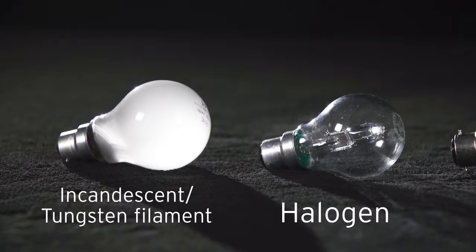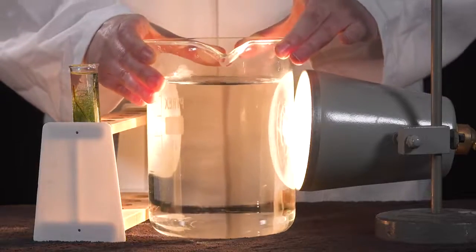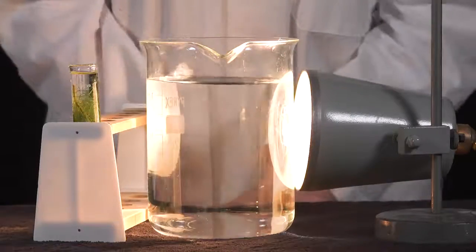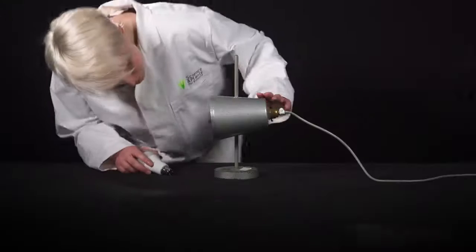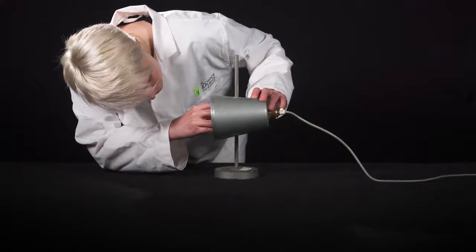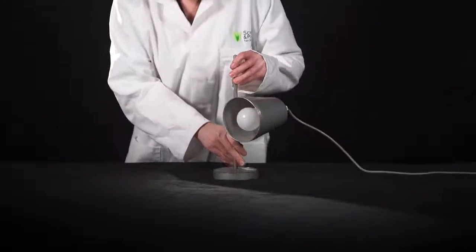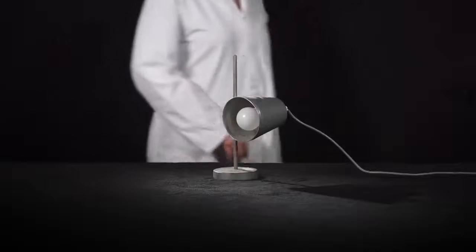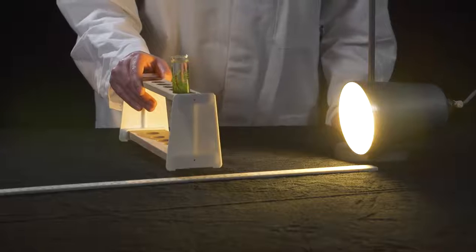Tungsten filament or incandescent bulbs and halogen bulbs will need a heat sink between the pondweed and the lamp to reduce heating effects. CFL, energy saving, or LED bulbs won't need a heat sink. You can fit these bulbs to the ordinary desk lamps you already have in your lab. Bright light bulbs will ensure that students will be able to investigate the effect of light intensity effectively by moving their setup away from the light source.